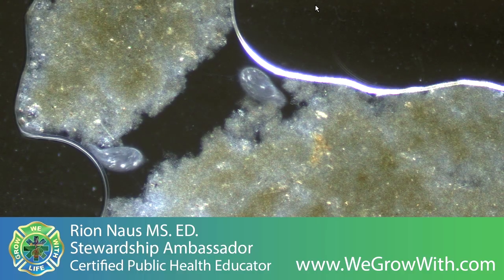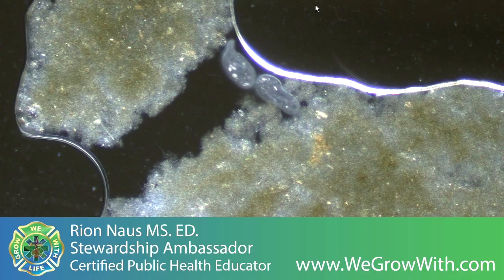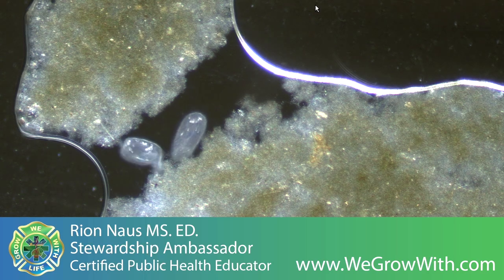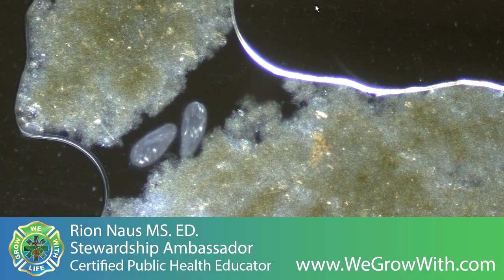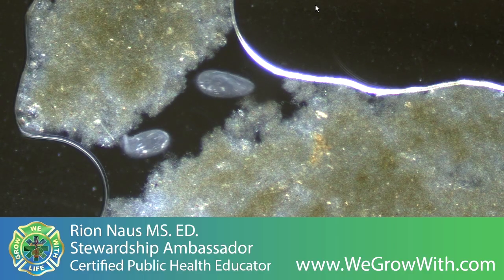It's all real. It's all something you can look at, you can learn about. For some people it weirds them out because they've never thought, period, much less about it. And so instead of just turning this off and taking care of other things, it takes time to watch this process.